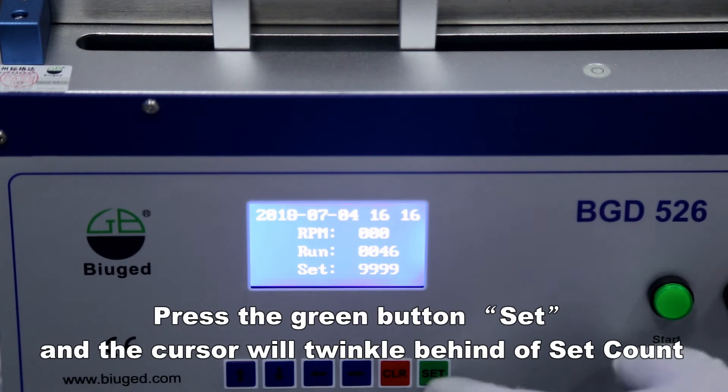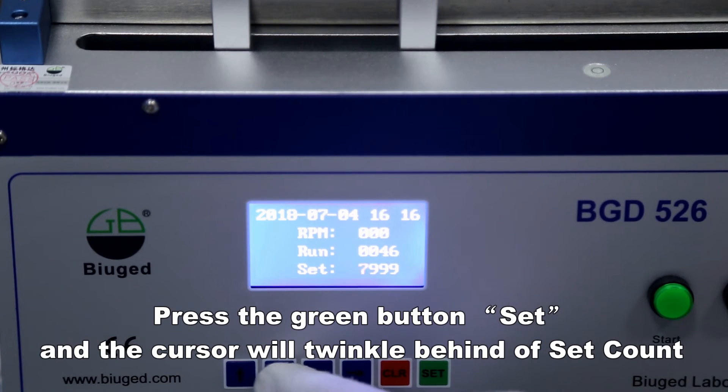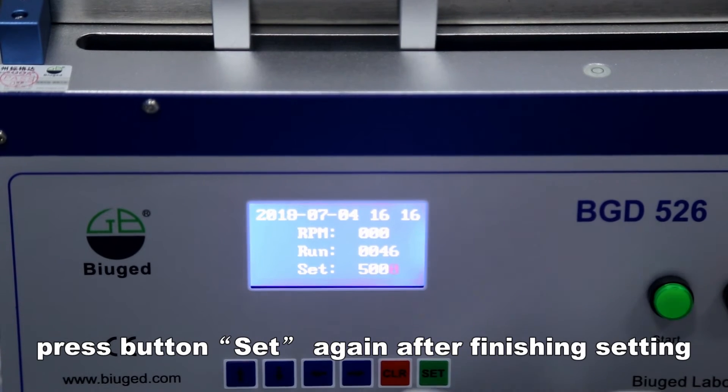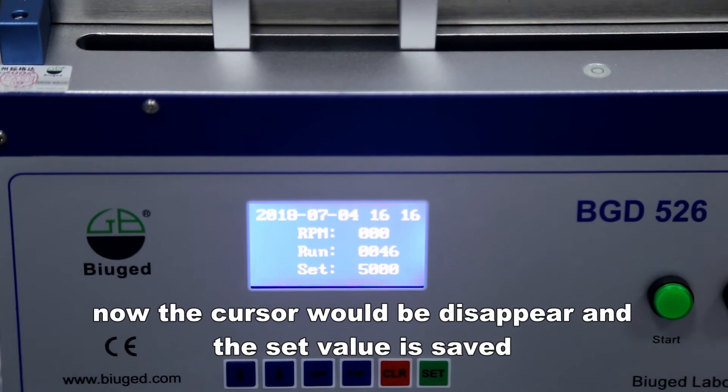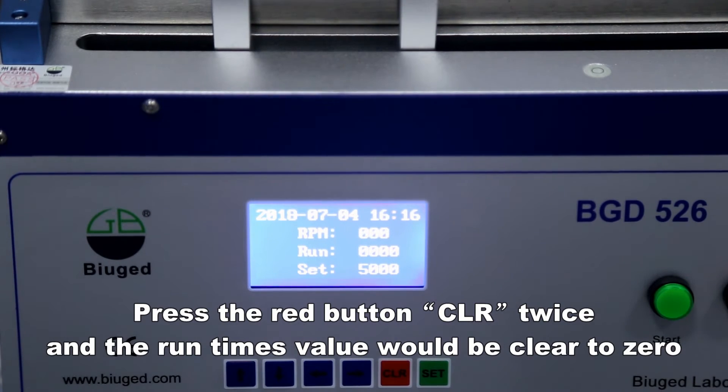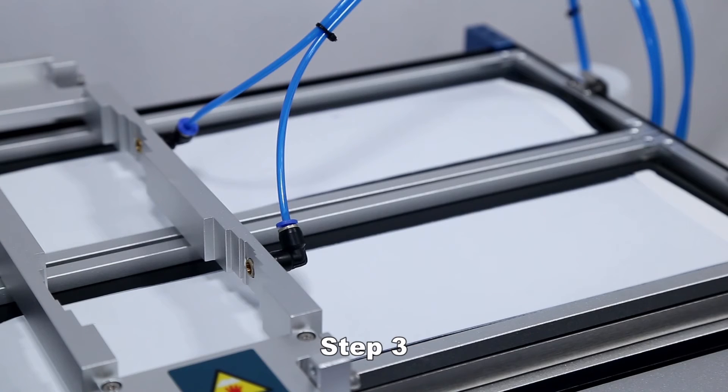Set the test time by pressing the green button. The cursor will blink behind the set count. Press the button to set the required number, then press the set button again to save — the cursor will disappear and the value is saved. To zero, press the red button CLR twice and the run times value will clear to zero.